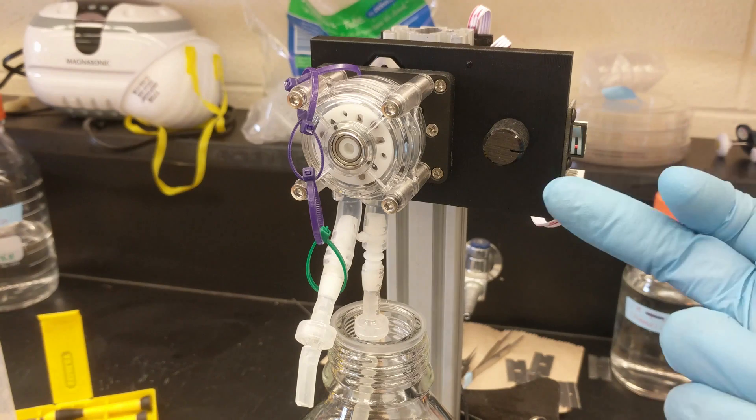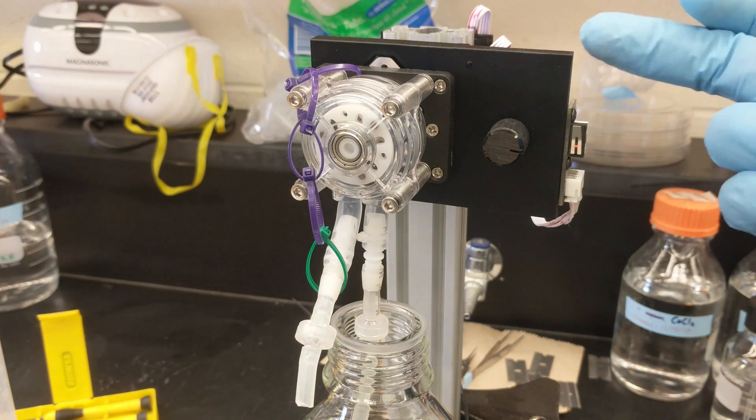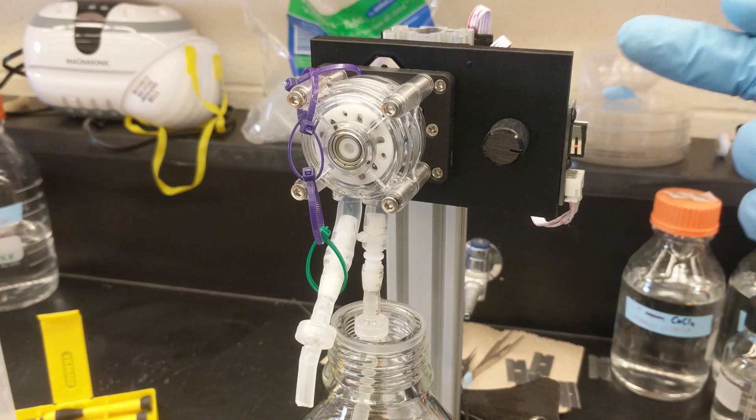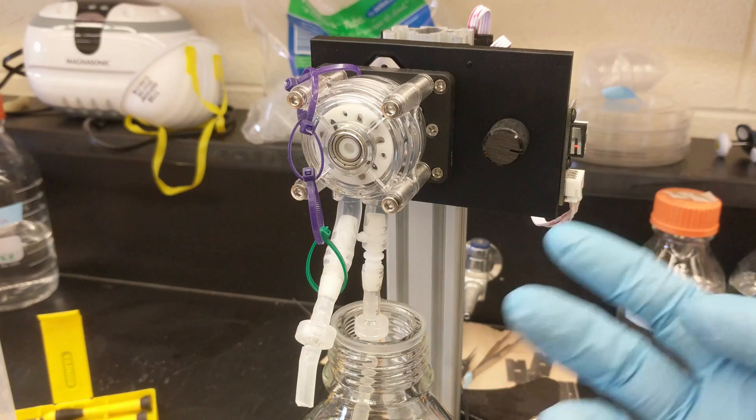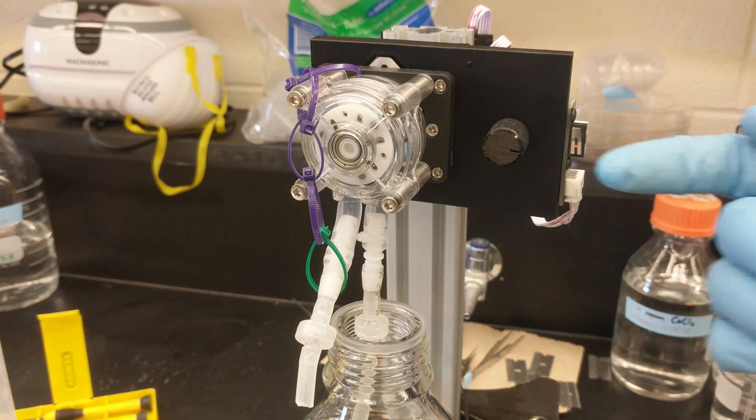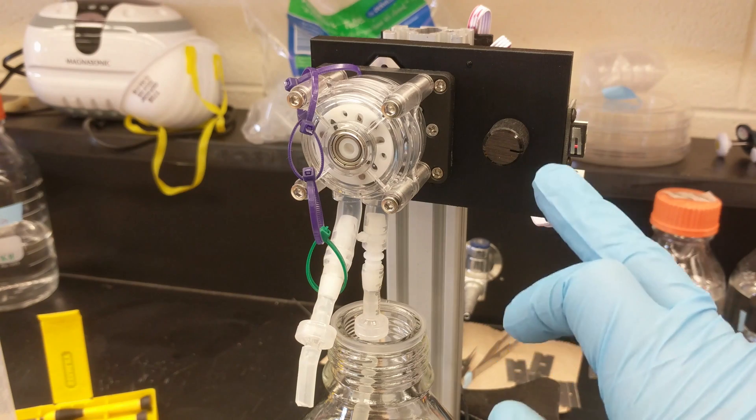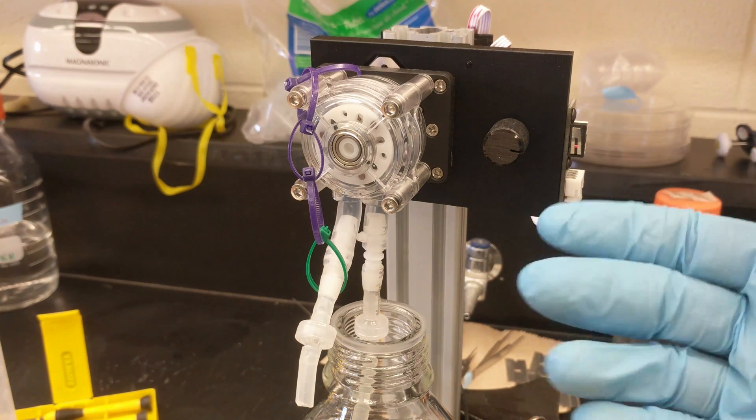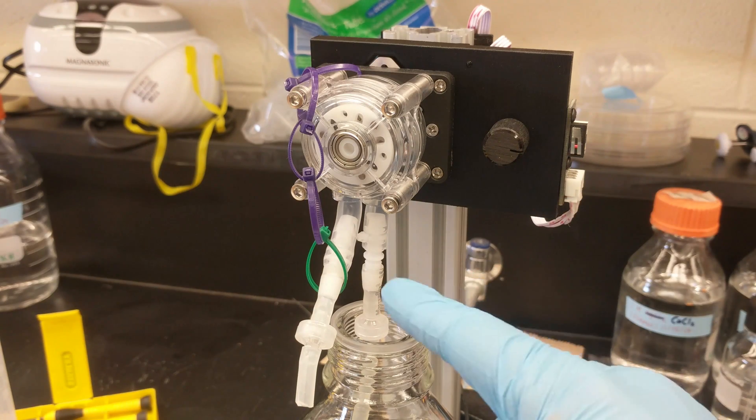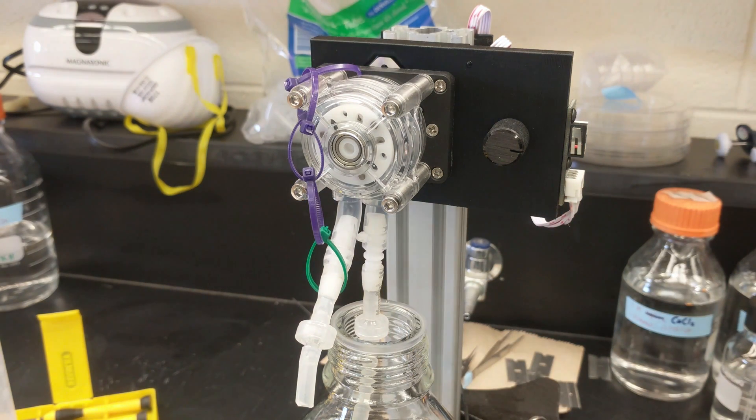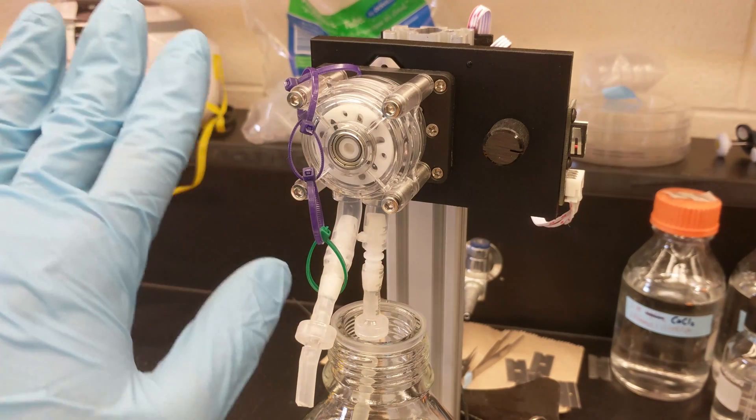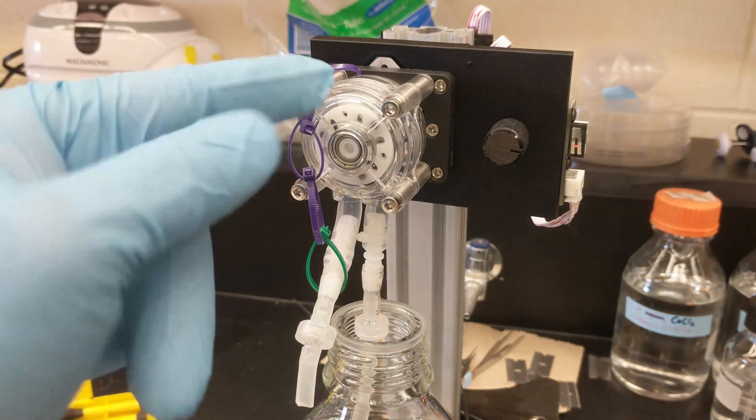And you can upgrade it in a couple of different ways. For example, you could have multiple buttons here that can dispense set volumes rather than having to adjust it every time. That's actually probably what I'm gonna do, because every time that you adjust this knob you have to go and check on the scale how much this thing is dispensing.